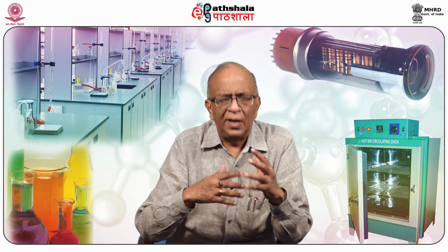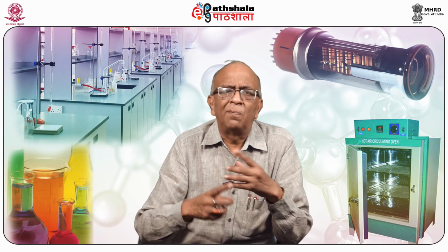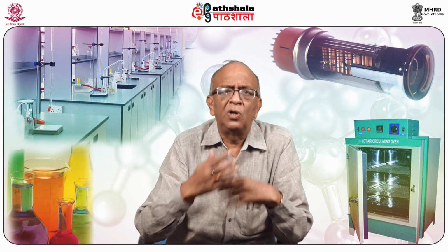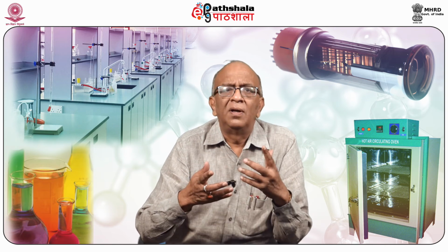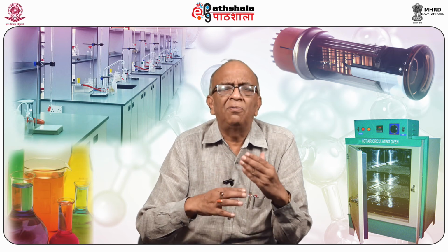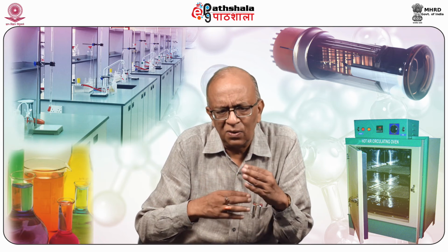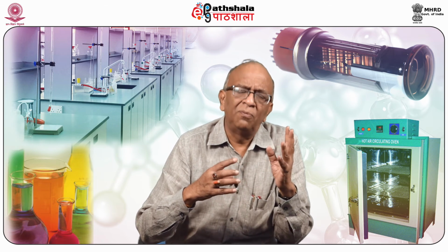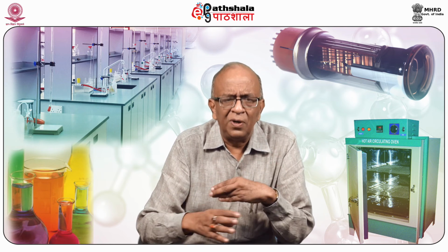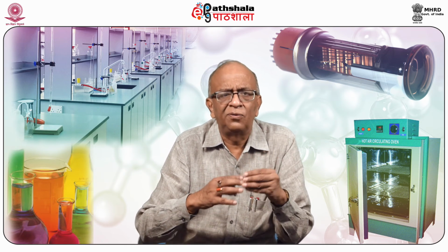As in the case of gas liquid chromatography, we vaporize the components. So at that temperature, the solvent which we are taking as a liquid phase should not boil. It should remain unreactive and in the natural physical form at that temperature. This is the characteristic of that. Another characteristic of that liquid phase is that its behavior should not change with the temperature. It should be stable at different places of the column. When it is moving from inlet to outlet, its chemical and physical nature should not change.